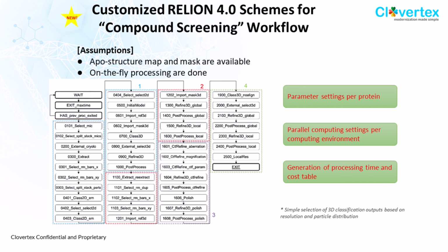Therefore we are repeating a similar procedure and getting very similar structures. The only difference is whether this small compound, meaning the small molecule, is attached to the protein or not, and if it's attached, how it is posed relative to the protein. This is very helpful for drug design, choosing the best optimal small molecule as a drug.